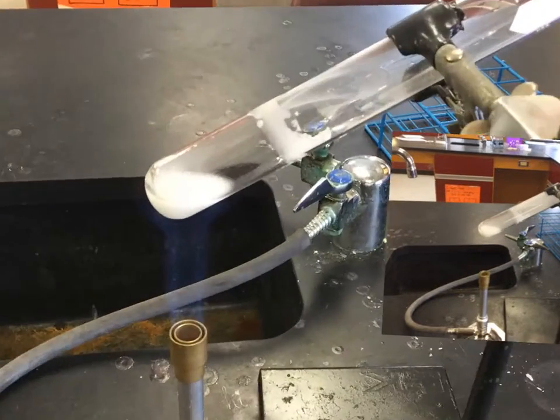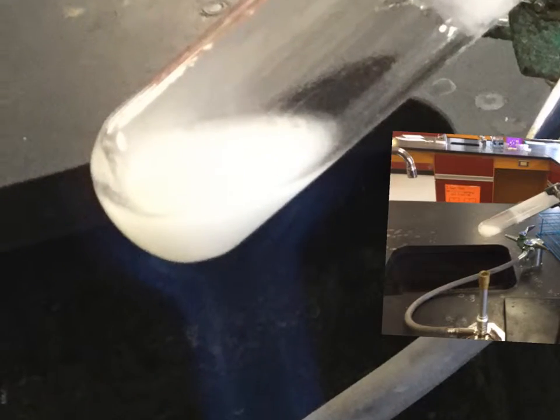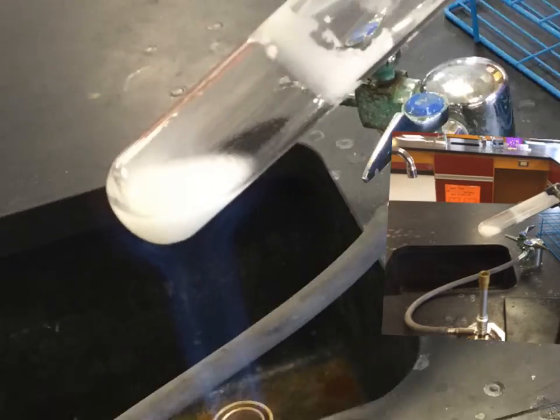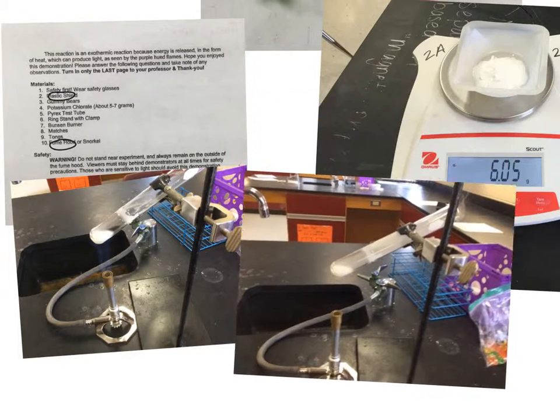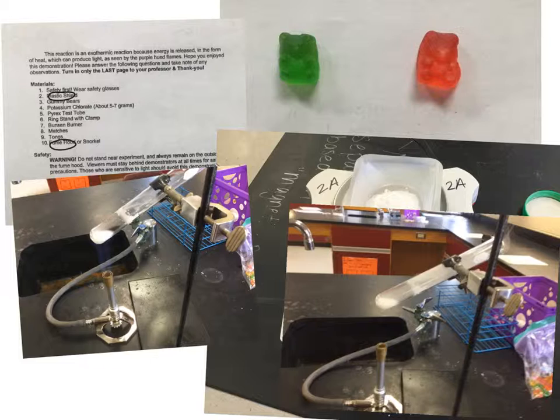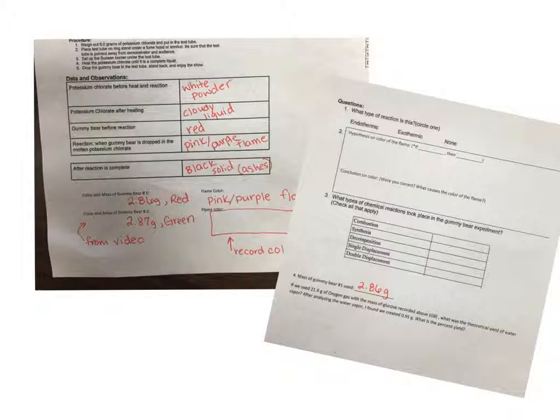You can then also see after the first reaction where we are melting, you're basically melting the potassium chlorate. You're making it molten. You can see that it turned into a liquid right there. And this is a little video just showing that it is a liquid. Okay, and so those are all the little pieces that we are going to be using.